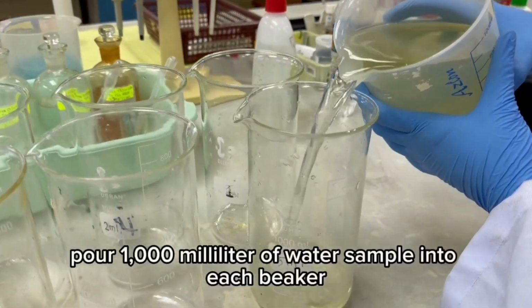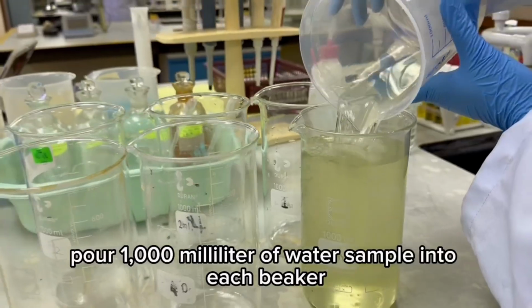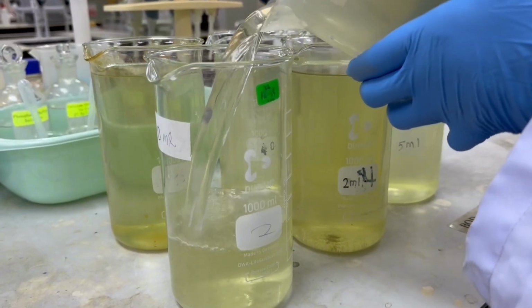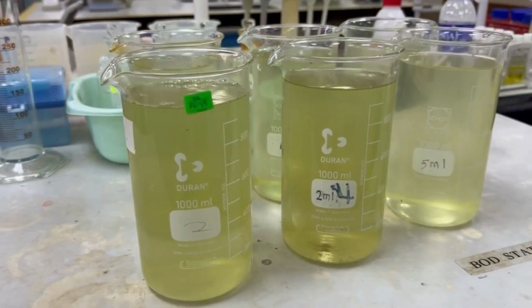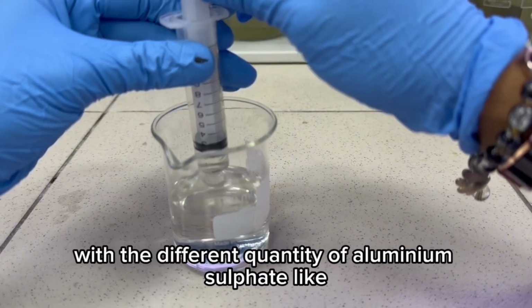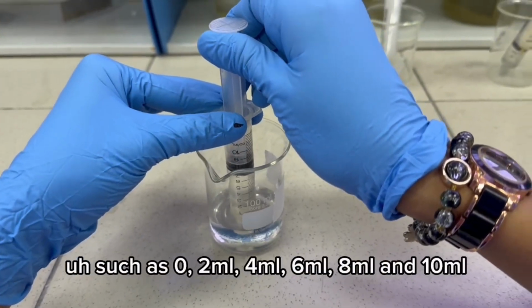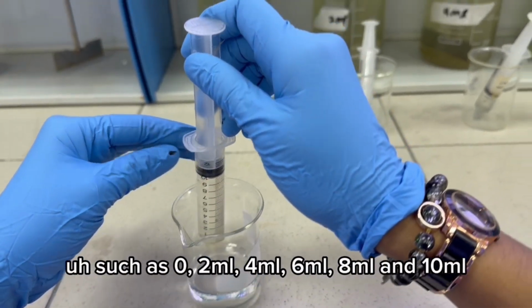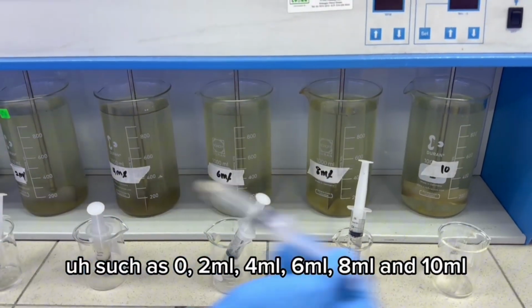Firstly, pour 1000 ml of water sample into each beaker. Preliminary, fill the syringe with different quantities of aluminium sulfate, such as 0, 2 ml, 4 ml, 6 ml, 8 ml, and 10 ml.